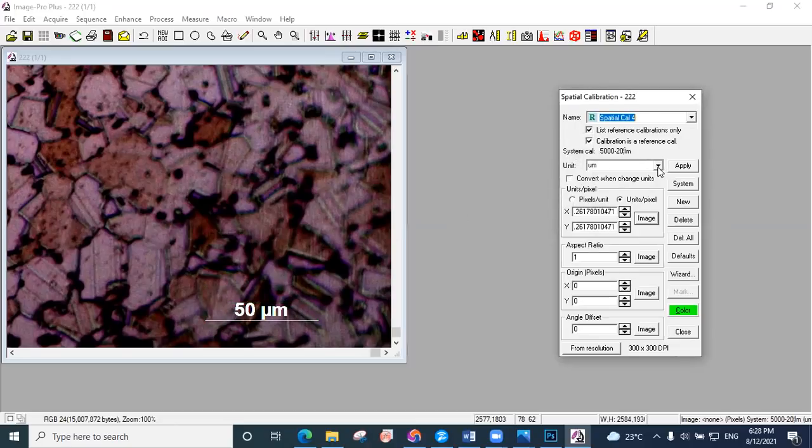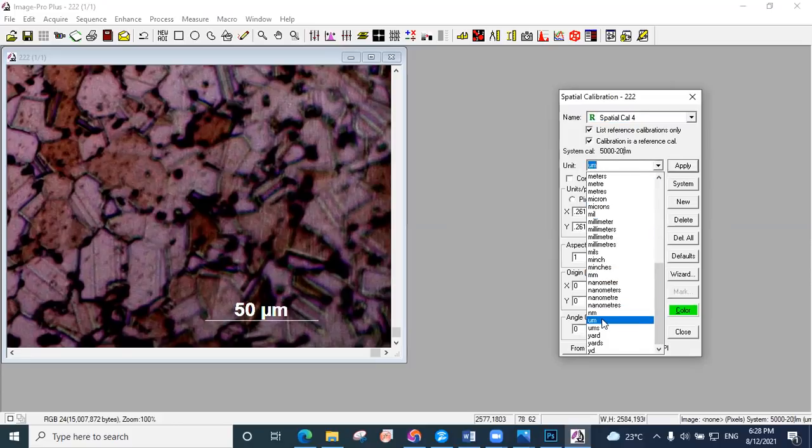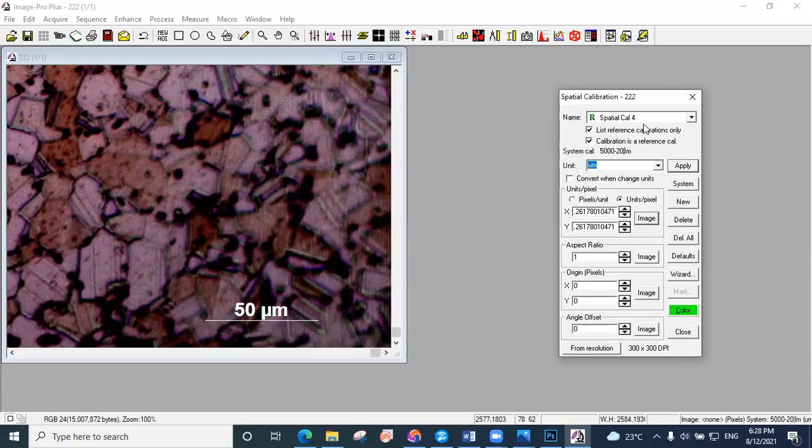Then choose here, we have micrometer, and go to the values here and choose UM. And then name these values or the measurements. Just name it, for example 1H or 2H, or 12112, or any name, or you could say 222, any name here, then say apply.